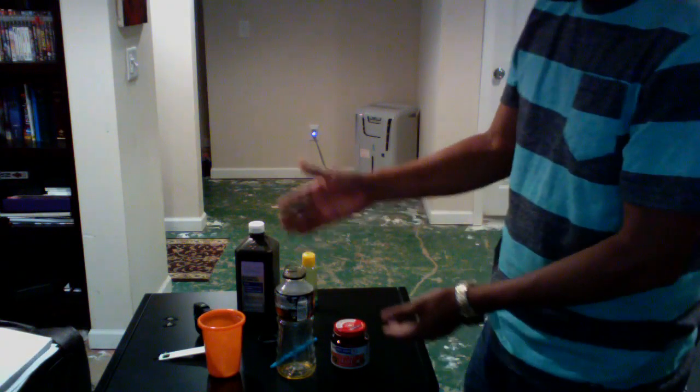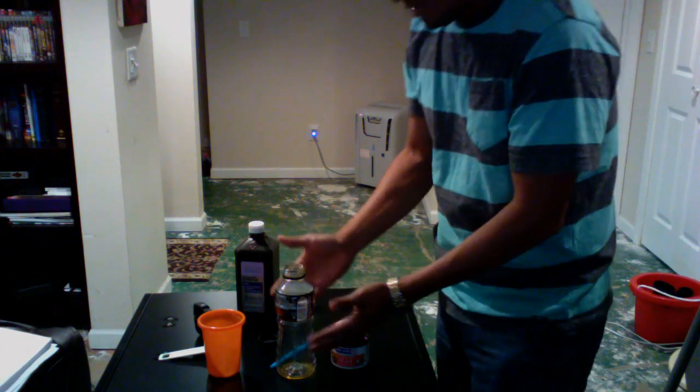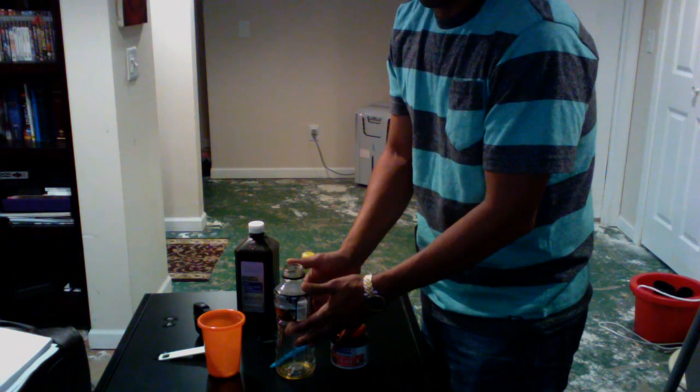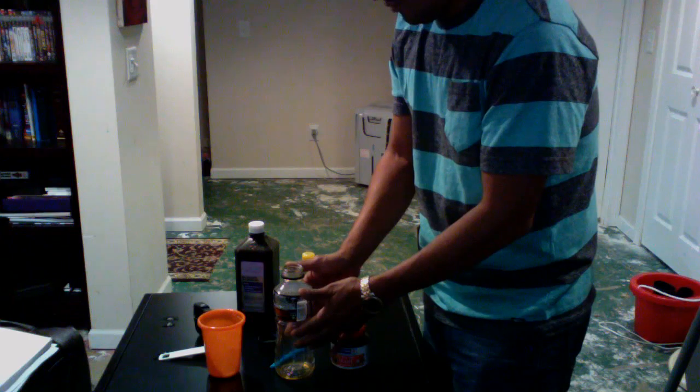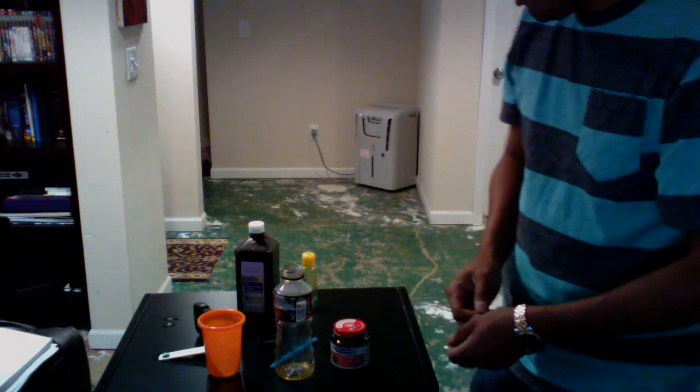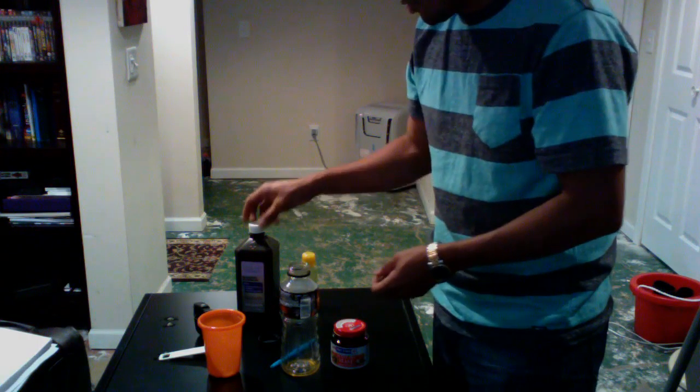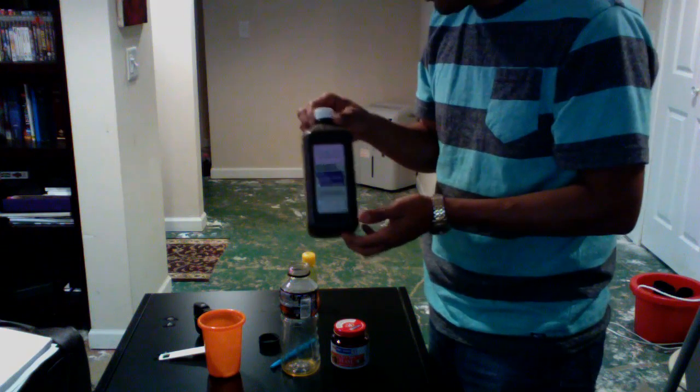So we pour this in here, and you will see the reaction, and there you go. Ta-da! There's a lot of foam coming out, and then you can feel the bottle, and it's hot. That's the exothermic reaction demonstration that we have today. Sometimes it works, sometimes it doesn't. Just make sure that you always have an adult with you, especially when you are working with hydrogen peroxide. It can irritate your eyes if it gets in there, so just be careful.